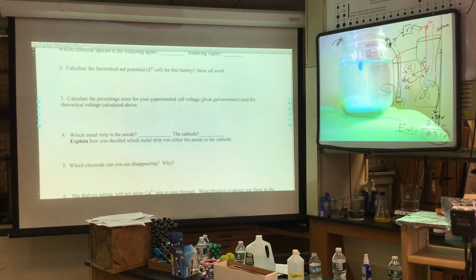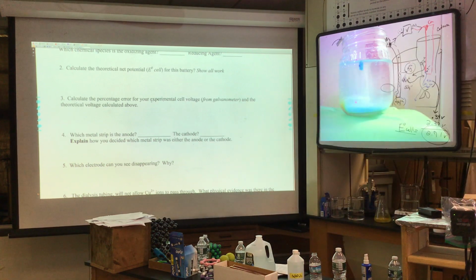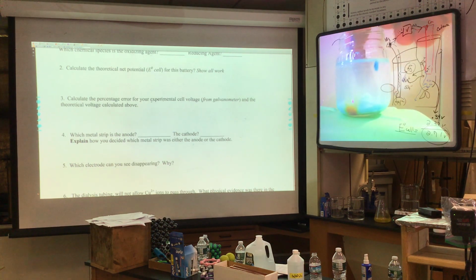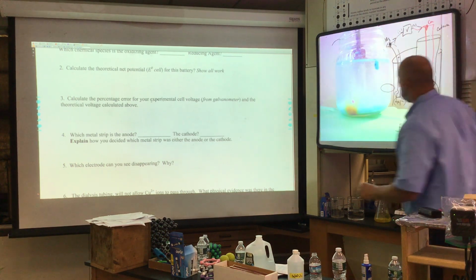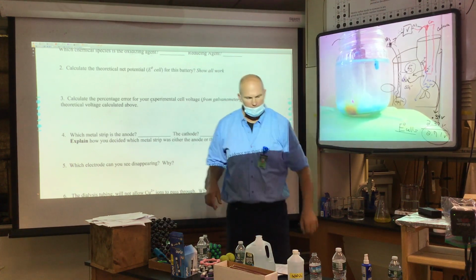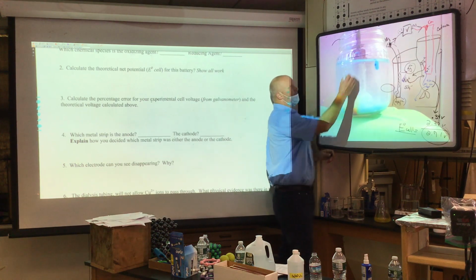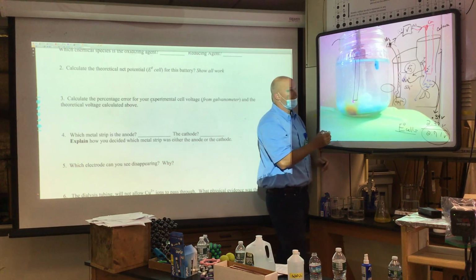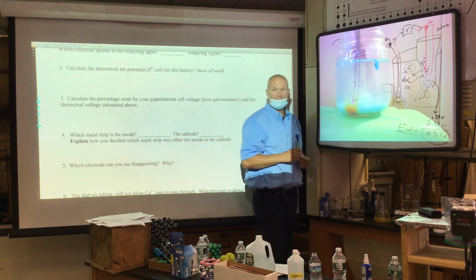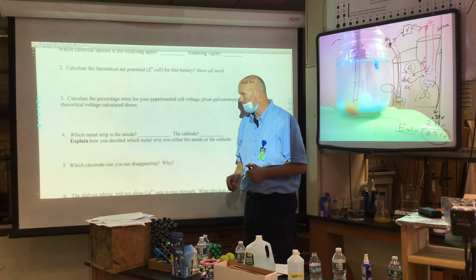Okay. So, here is my magnesium, and it's hard to see, so I'll bring it into the closer foreground here. I'm going to turn it. And there it is in all of its glory. Can we see it now? Yeah. So there is my magnesium sticking out, and it stops right here. Why does it stop? What happened to it? Yeah. When the solution was up to here, some evaporation, the magnesium was very long. And what happened to it over time? It oxidized. So why do you see it disappearing? Because it got what? Oxidized into an aqueous ion.